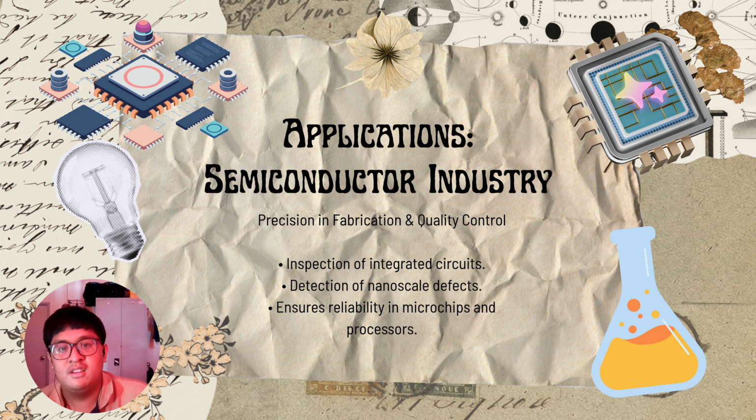Finally, the semiconductor industry. Microscopy ensures precision and quality control. It is used to inspect integrated circuits and detect nanoscale defects, ensuring reliability in microchips and processors, the foundation of all modern electronics.